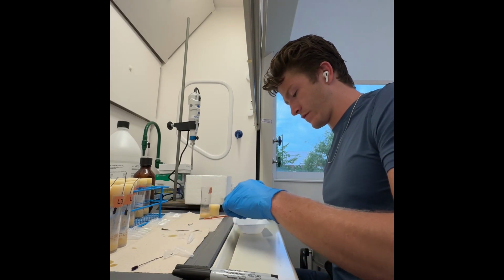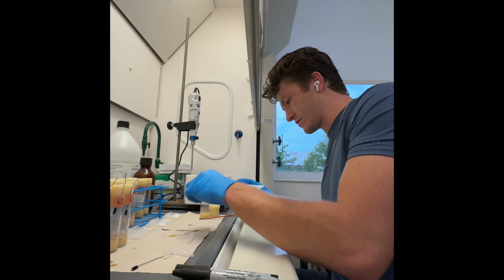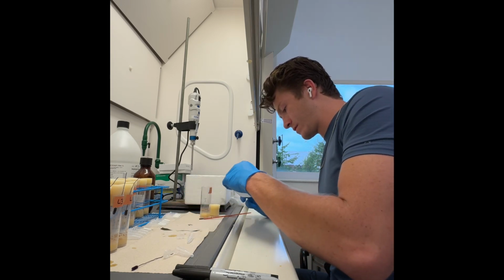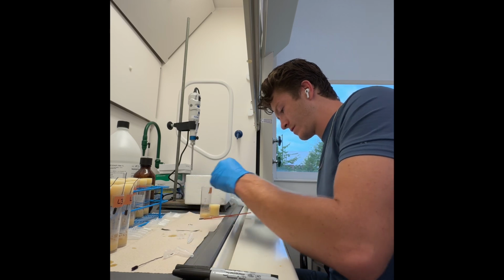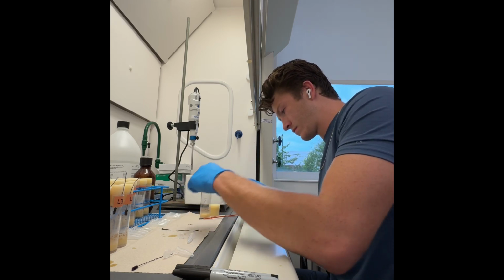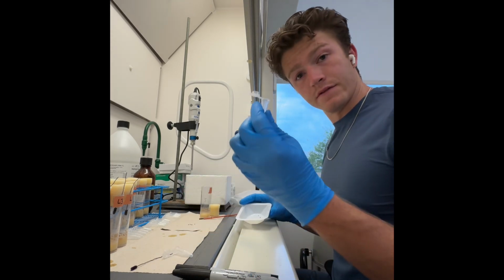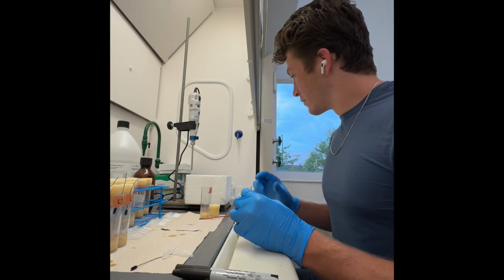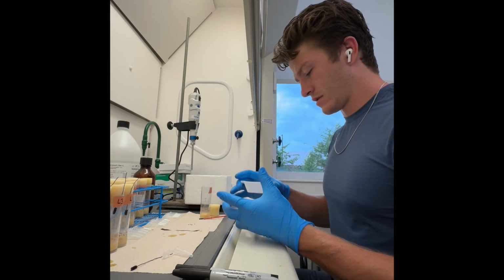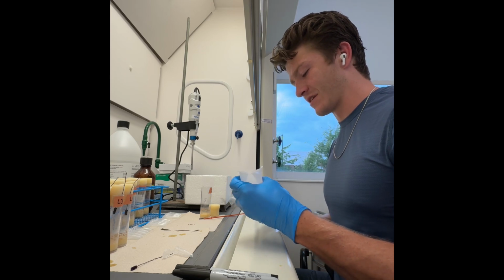I'll do this one full process here. Sorry, it's kind of annoying as I use my fingers to pick up these little fruit flies, but it's okay. So that's 3, 4, 6, and now I have 5 little flies in there. I have this little tiny vial, which is what they will be frozen in. So put this vial here. Problem is they get staticky and they start bouncing around, which is crazy.